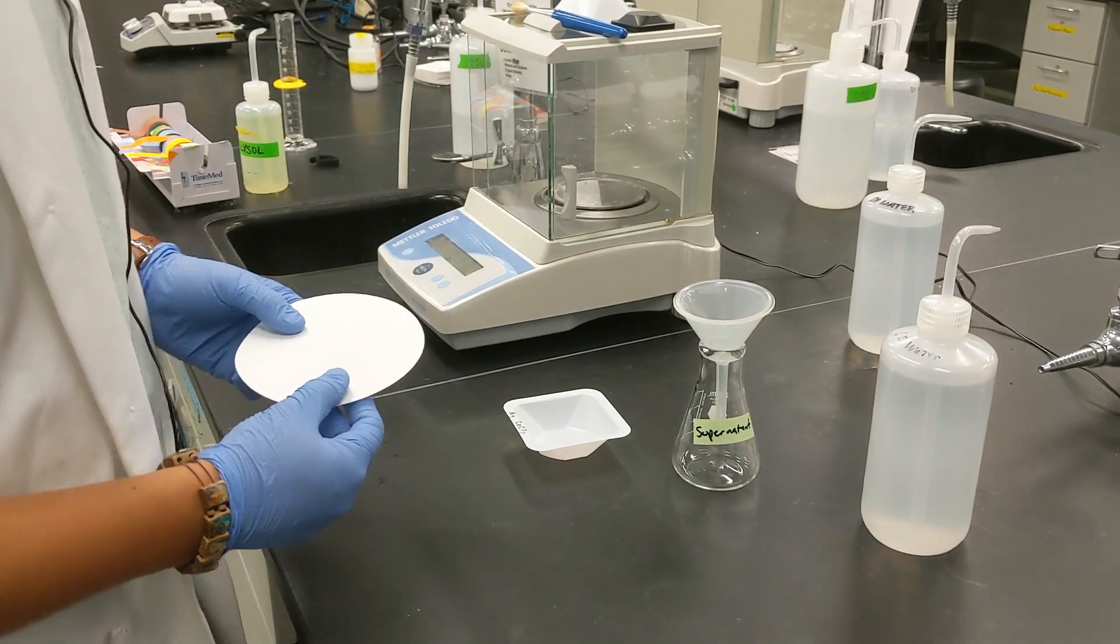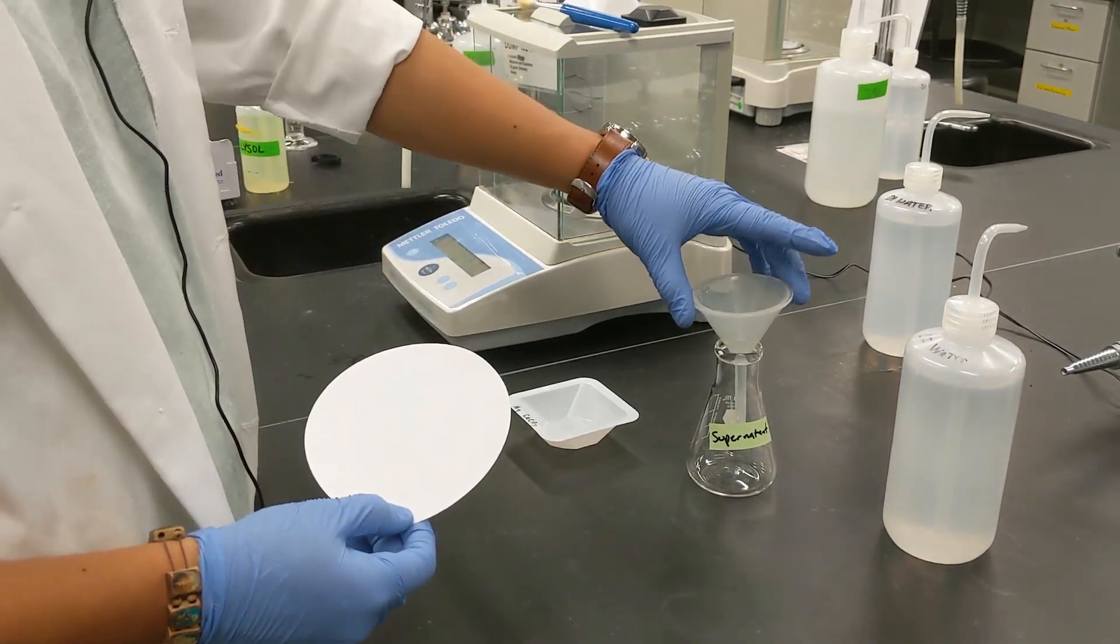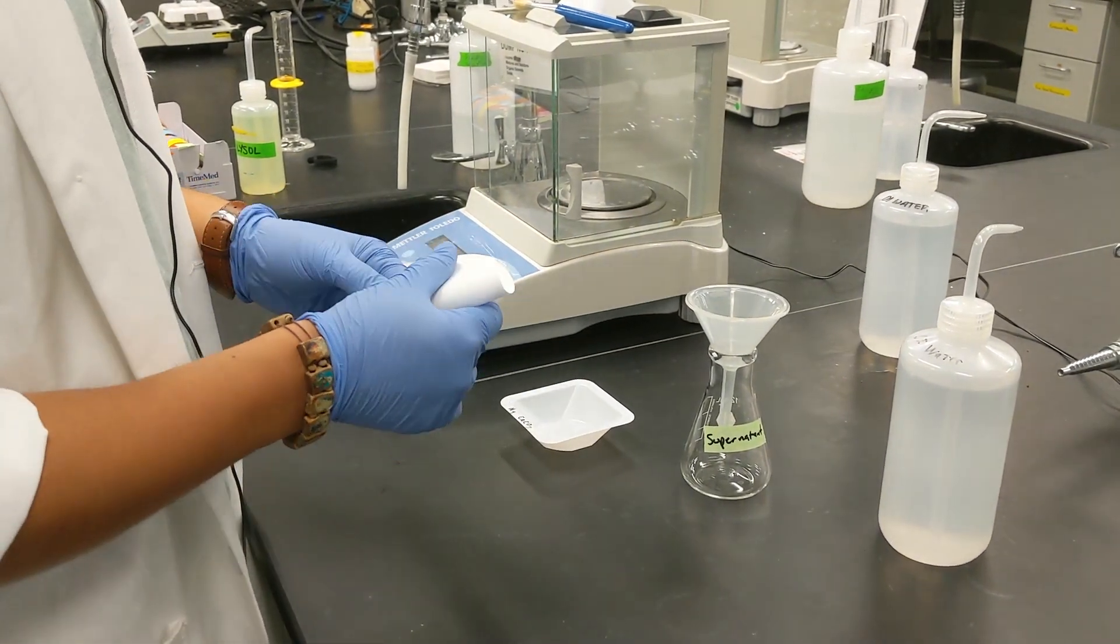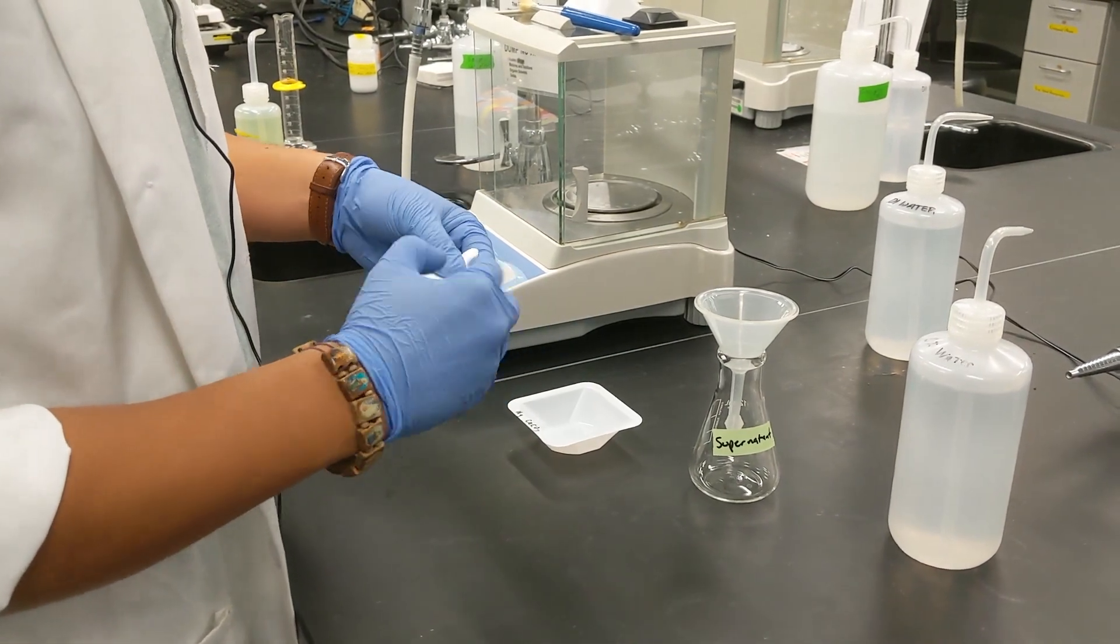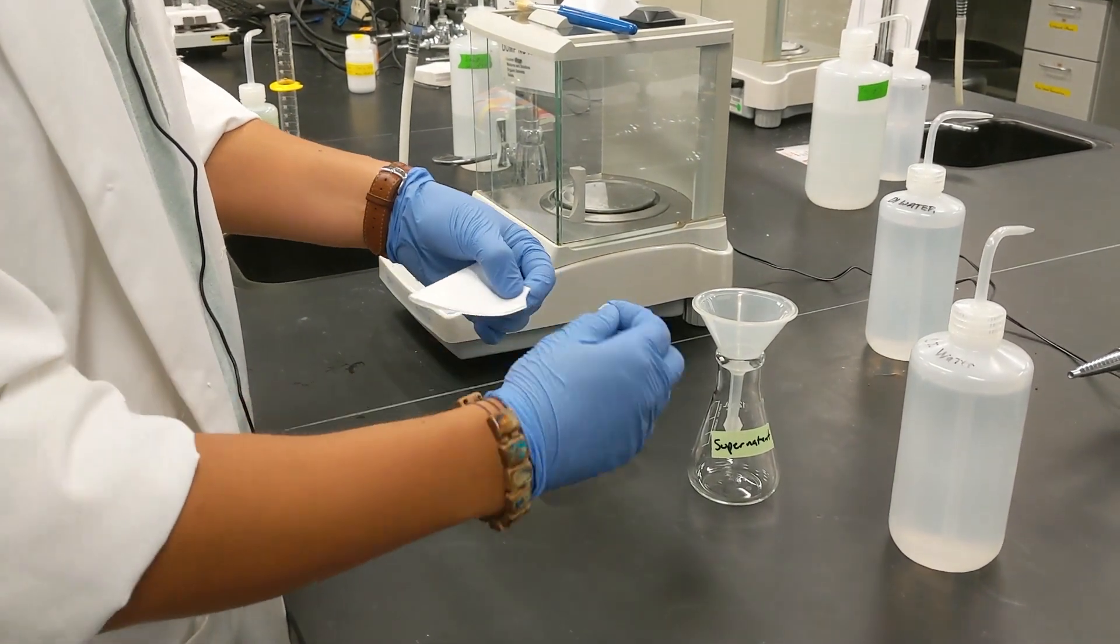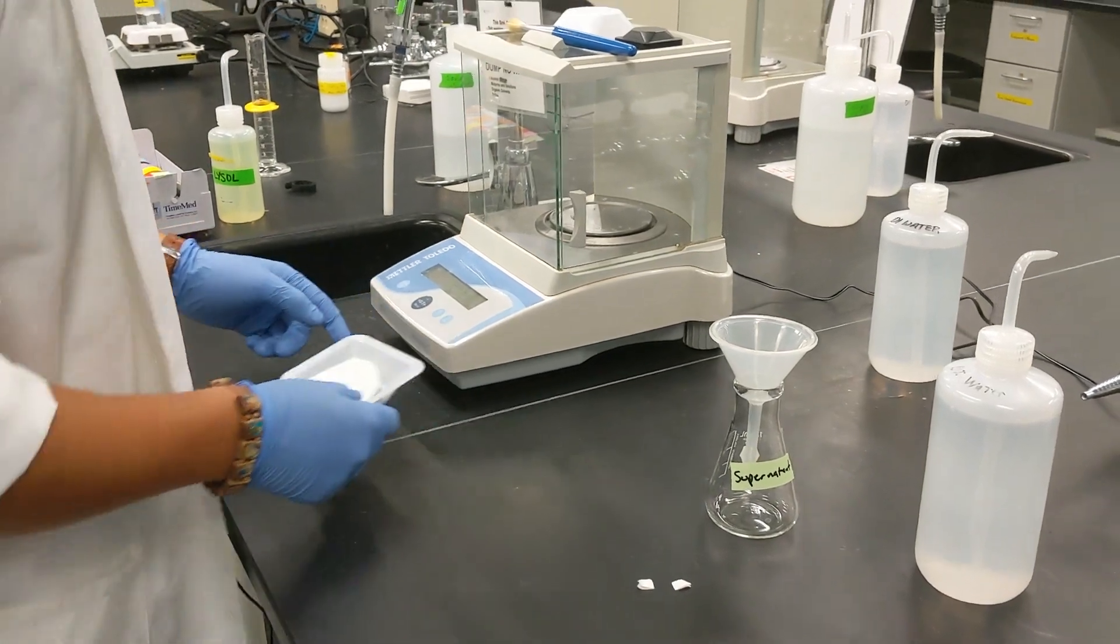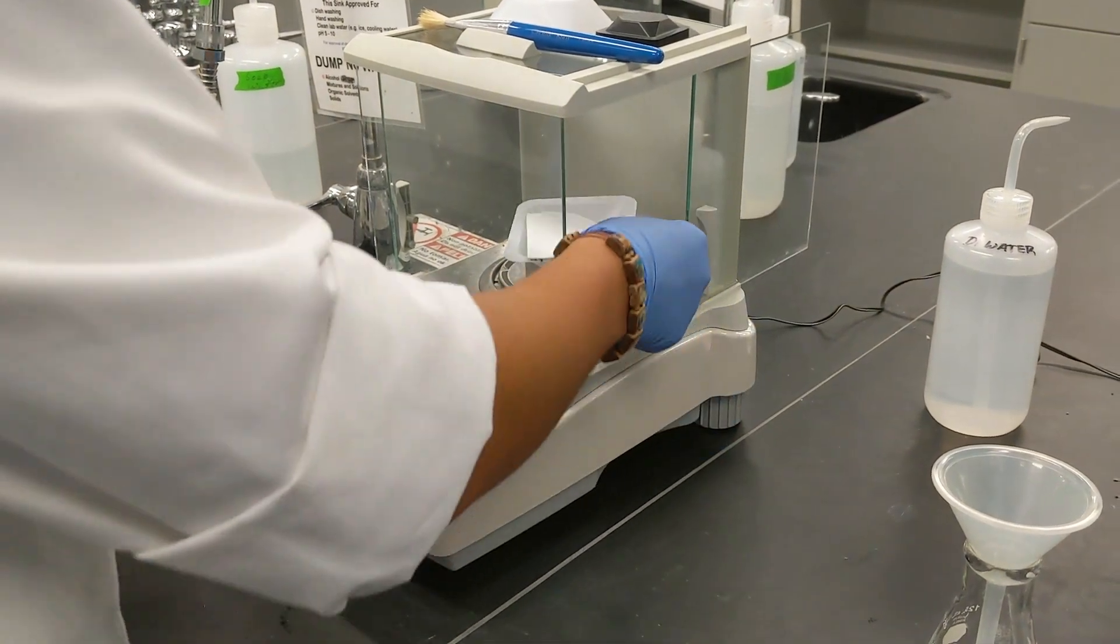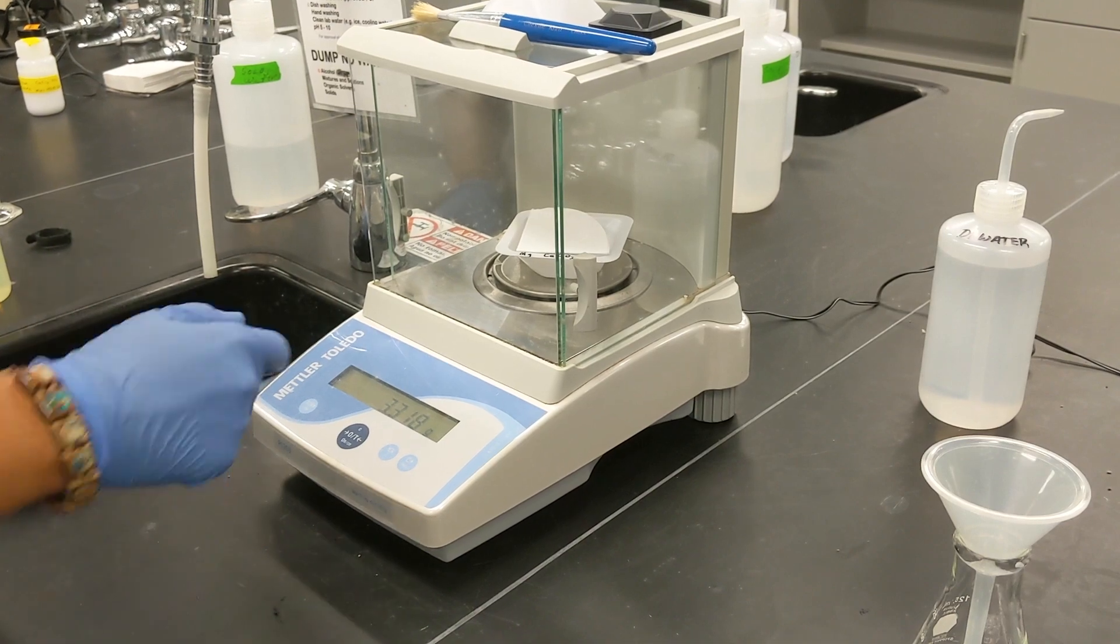Now we're going to set up our filtration device. We're going to have a weigh boat labeled. We have our filter and we have an Erlenmeyer flask here and our filter paper that we're going to fold in half. Fold this in half again to form a quarter circle and then we'll tear off a corner of our filter paper. We'll put this onto the weigh boat. We'll zero out our scale because we need to weigh this first. Let it equilibrate. We'll record that mass.